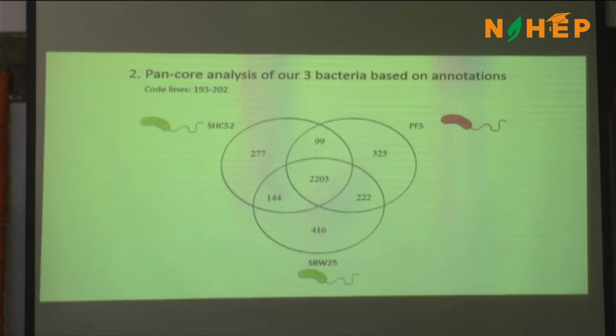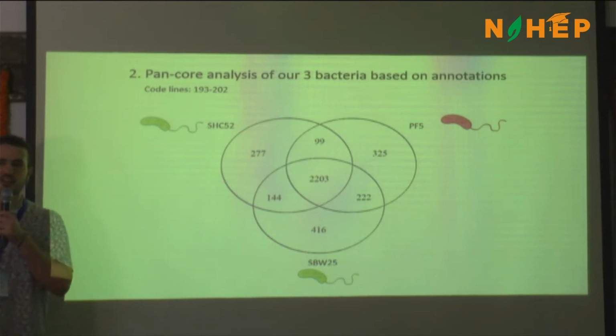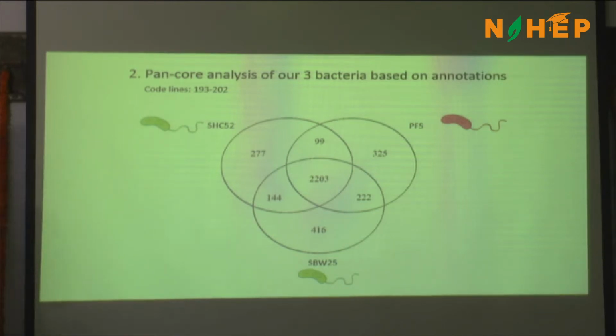And in our analysis, we are looking for some genes or COG categories that are only present in our phenotype, in our bacteria with an antagonistic phenotype. So how many do we have? Where are they in this plot? Can someone tell?